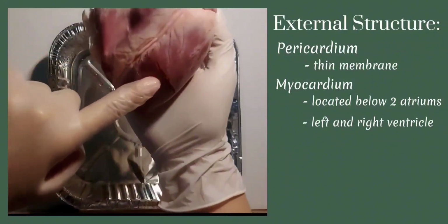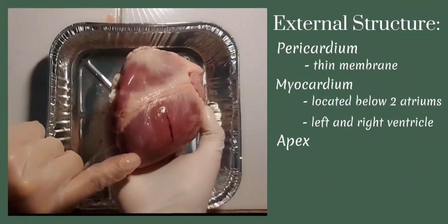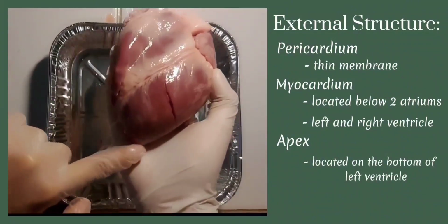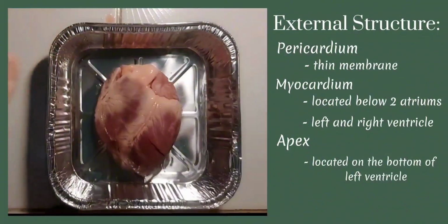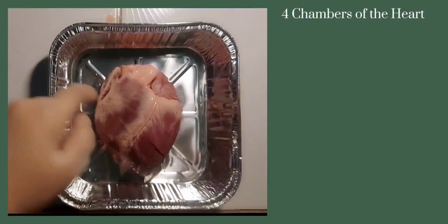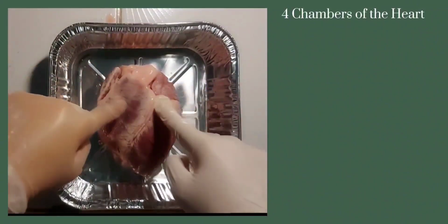And when we go down on the bottom of the left ventricle, we can see the apex. This part or tip right here is the apex. The next thing that we are going to do is to identify the four chambers of the heart from the anterior surface. Therefore, we put the heart down on the dissecting pan where the ventral side is facing us.